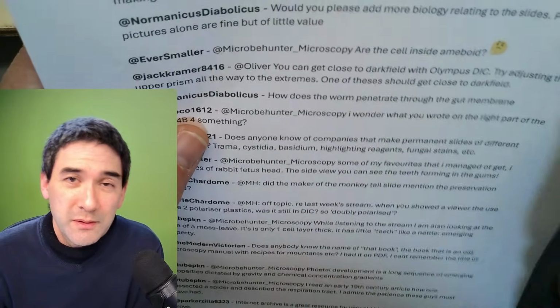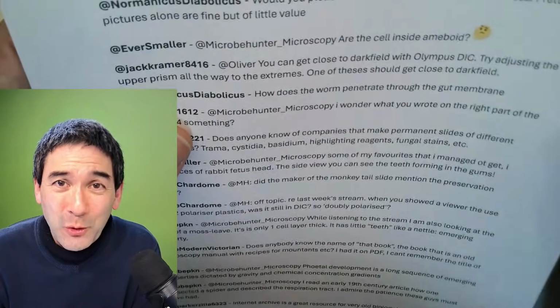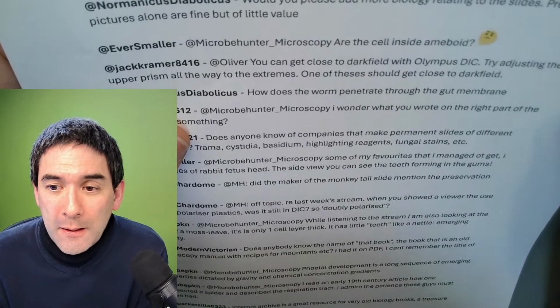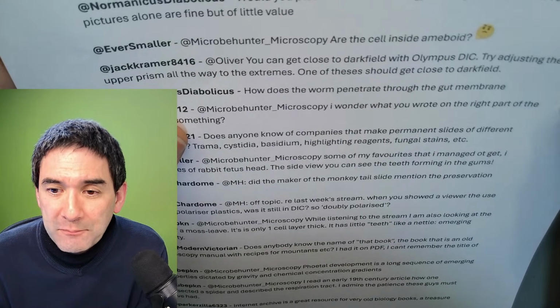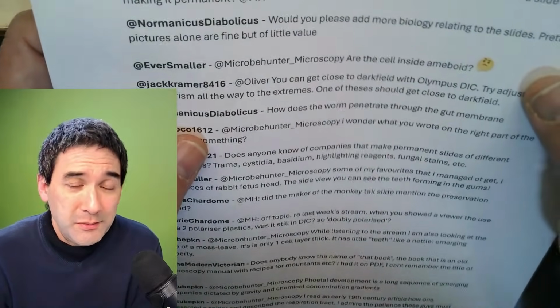Amazon depends, of course, on which brand and so on. Obviously, Amazon is just a retailer, not the company that makes them. But because they're much cheaper, there is quite a lot of dirt sometimes. AliExpress has some surprisingly good ones. Okay. So again, my suggestion is as always, don't spend too much, and take it from there.